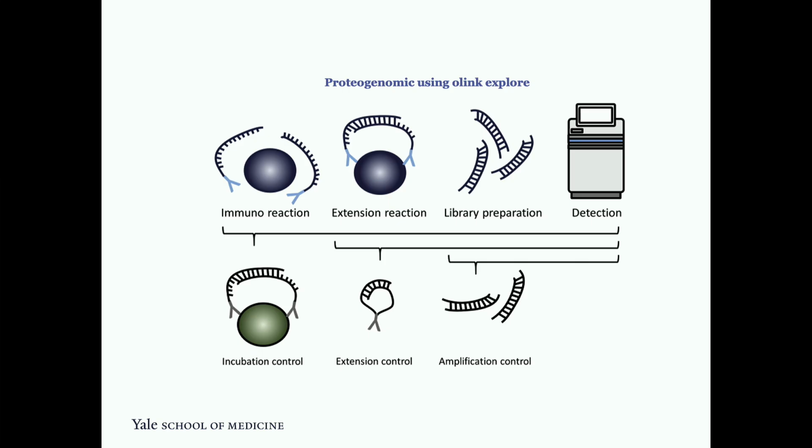There is a microfluidic chamber in the center, so liquid flows in all the combinations. You get 96 by 96 combinations, so you are doing that many assays. It does the qPCR, and then you calculate the CT values and do the quantification. Olink's Q100 system uses something like that, a modification of their old Fluidigm system.